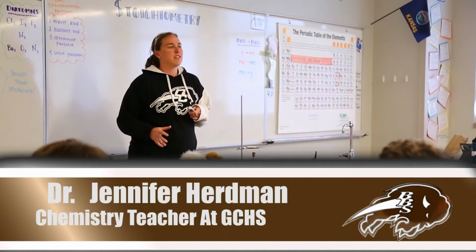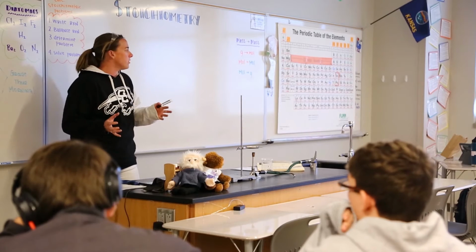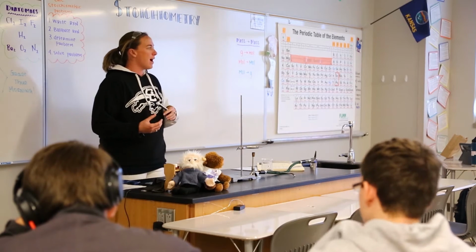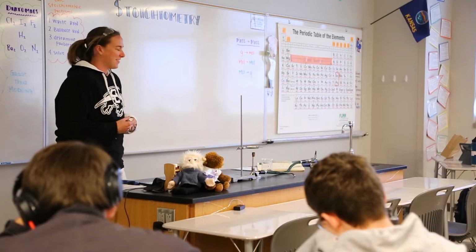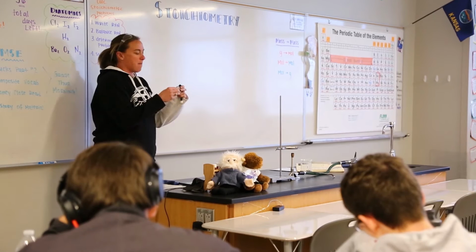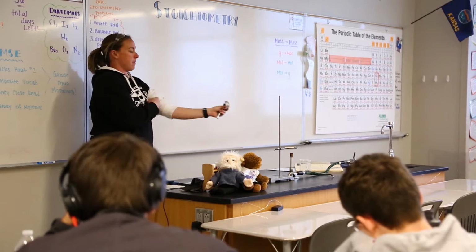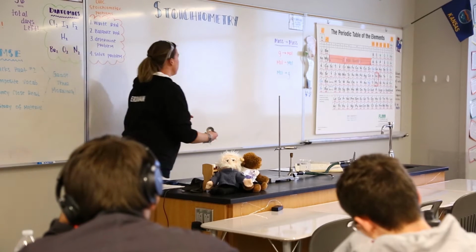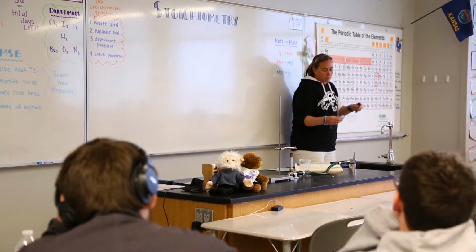So, as you guys know, we have been studying stoichiometry, so we should probably do a real-world scenario of how we use stoichiometry in the chemistry lab. All right, so today we are going to burn magnesium to get magnesium oxide. So magnesium is a metal, as you guys know. It's an alkaline earth metal, right, in the second column of the periodic table.